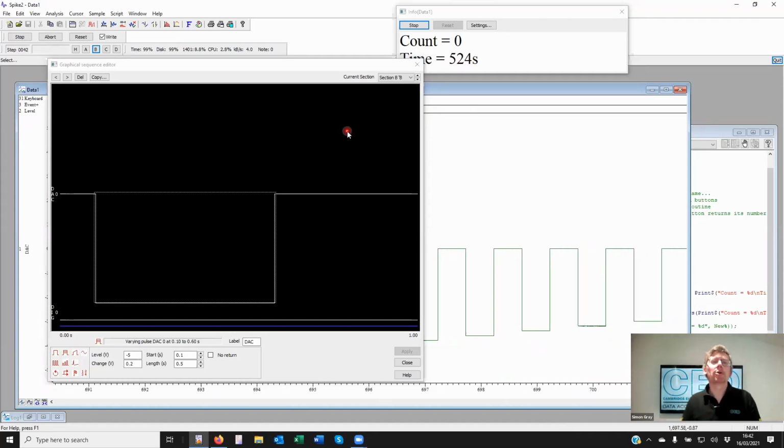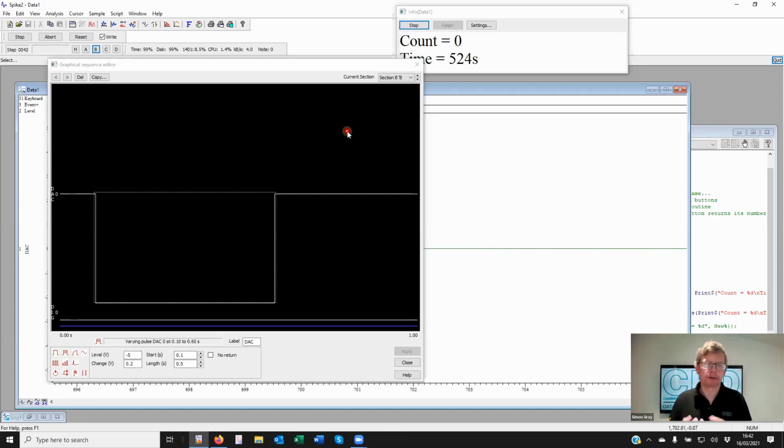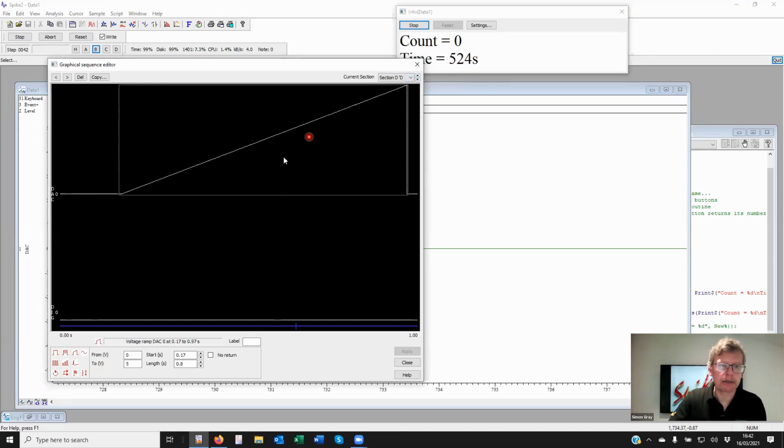So that's online control of the sequence, but beware, you will have to stop the sequence by the fact that you've made modifications and applied these, and then restart. Now, if you're proficient with a script, then it's possible to take variables from the graphical sequencer, certainly from a text sequencer, keep them within the script and reload them back into the sequence. So you can pretty much start again where you left off. All right, so that's a waveform change, C and D.